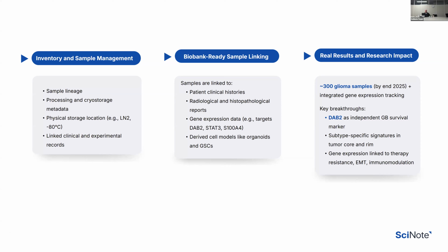Good. So, a quick overview. As I said, it was used by very multidisciplinary teams in different locations. It was used as biobanking software. They were building a gliobank, and they used SciNote as a single inventory management software together with experimental and clinical data to come to a few very important real results.